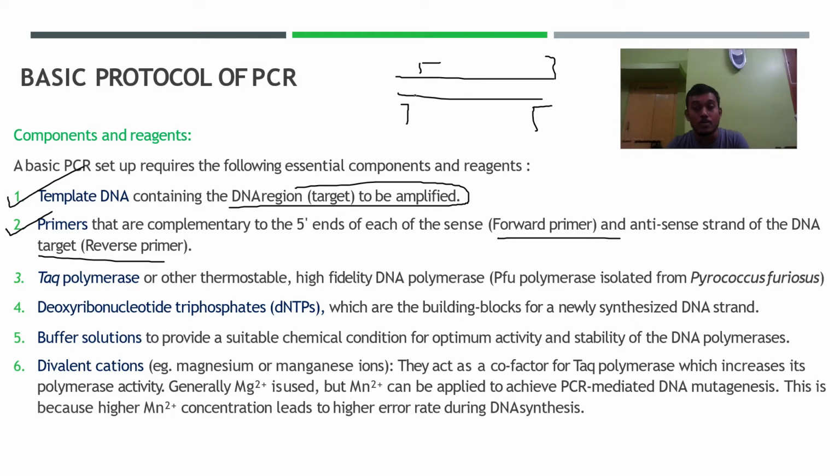What the primer does is attach to this particular part of the DNA like this, and this. Now the primer has hold of both strands of DNA, and this will extend the particular piece of DNA, creating more amplicons, or extending the size. Primers will keep on attaching and will help in the polymerase activity.